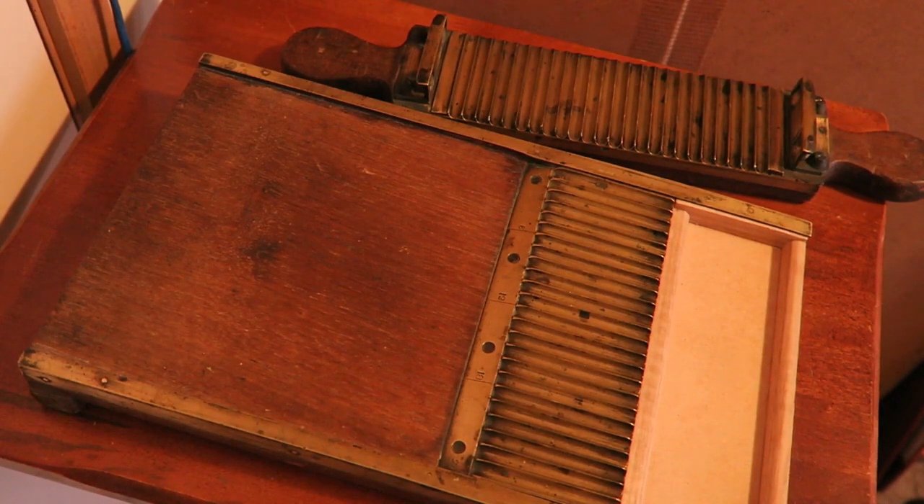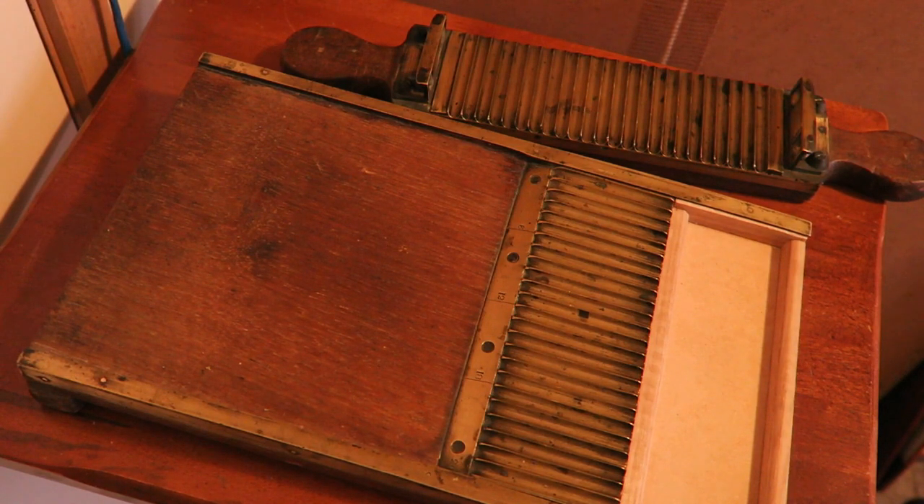Hello everyone. It's been a while since I made a YouTube video. I finally had some time so I thought I'd make a video about the object that you see in front of you. I won this at an auction house about a month ago and it's just about finished with its restoration. What we have here is about 150 to 160 years old. It is Victorian. It is mahogany and brass and it is an apothecary's pill rolling machine.